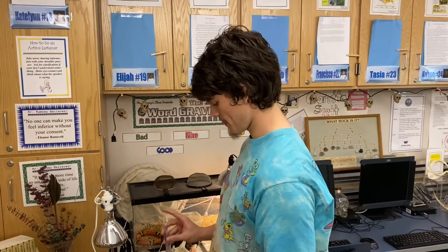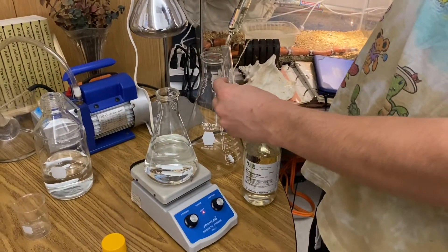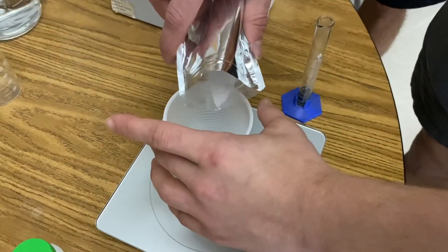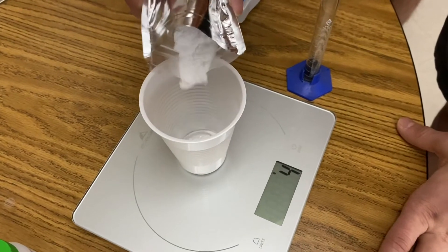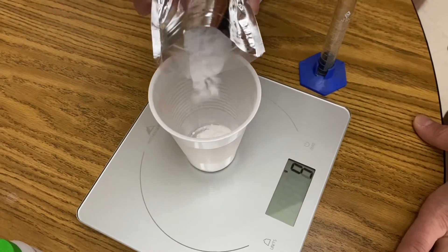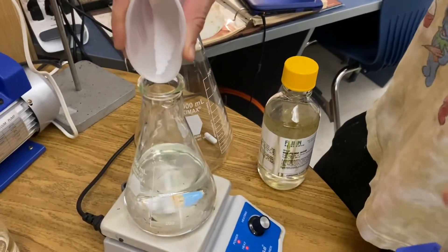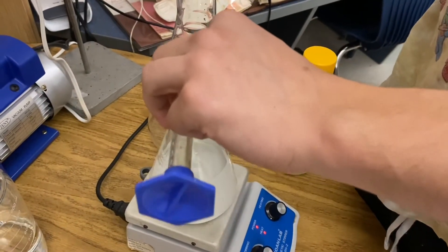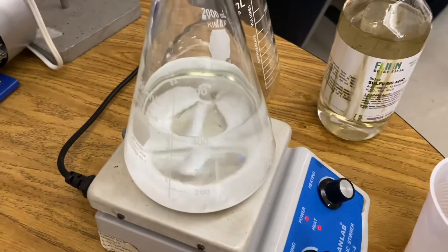First step: Zayn's going to add 2.5 milliliters of sulfuric acid to 400 milliliters of distilled water. Next, Alex is going to add 21.5 grams of potassium iodate — this is solution A — and combine that with 400 milliliters of distilled water. First we add the 21.5 grams of potassium iodate and let it stir, then the 2.5 milliliters of sulfuric acid. This is solution A — we're just going to let that stir.